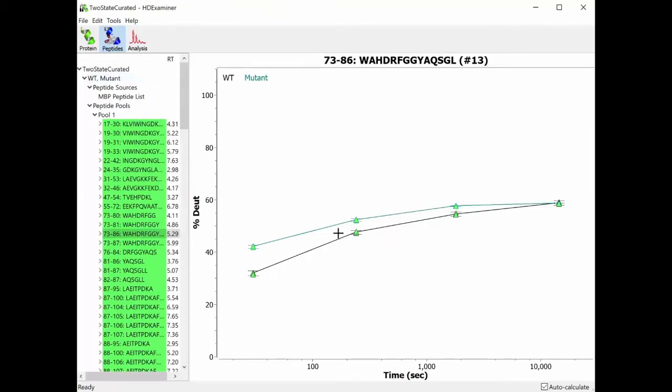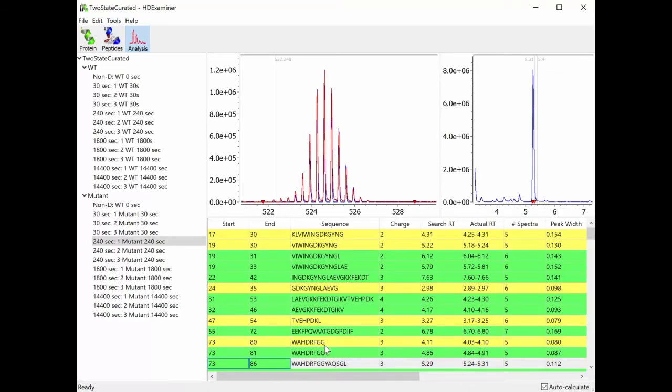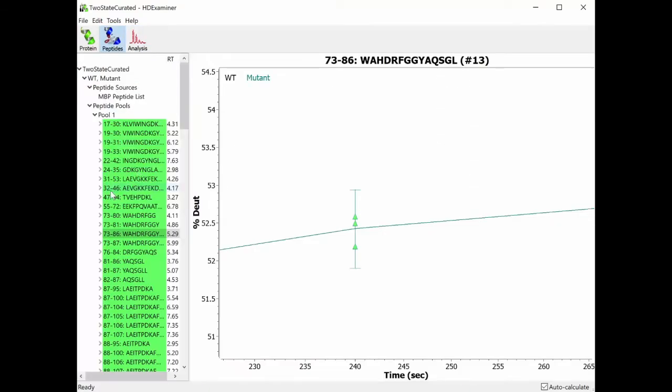In some cases, the shapes will badly overlap, and if you click on one in that case, nothing will happen, but you can still zoom in so that they separate out like that, and then you can click on an individual one, and it will take you to that result. So that's the first new feature.